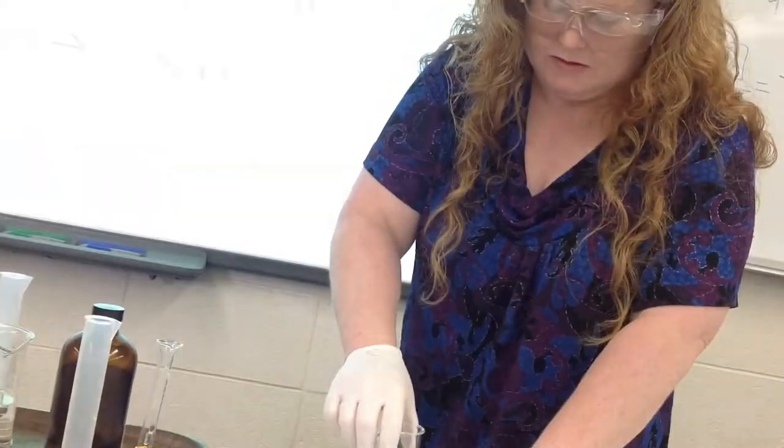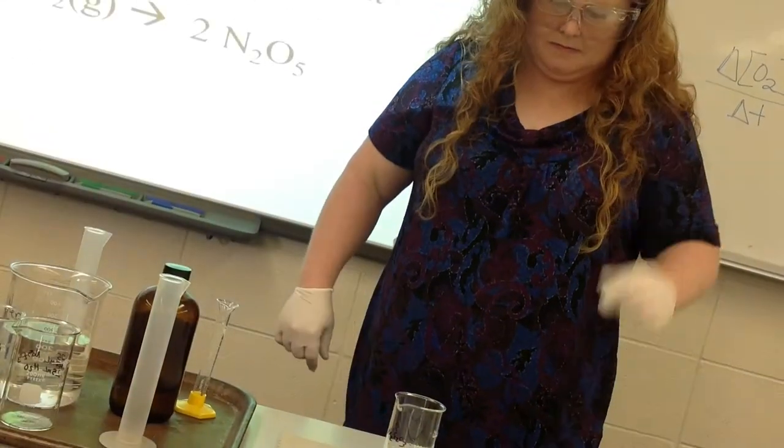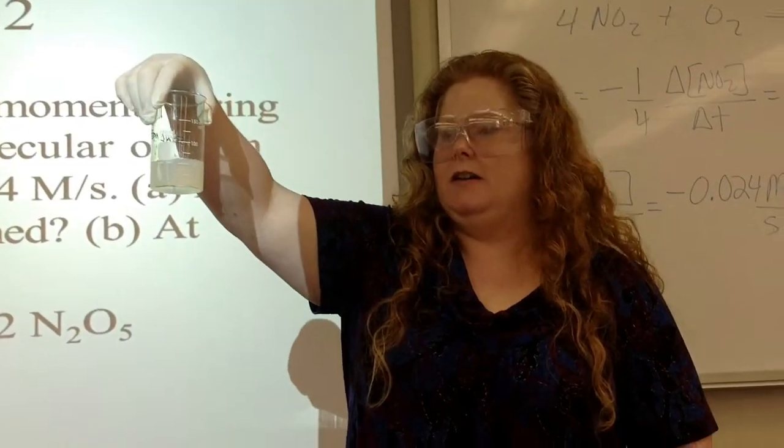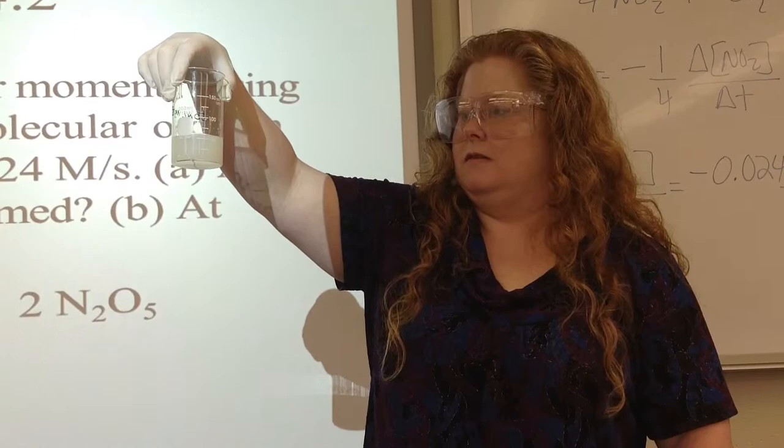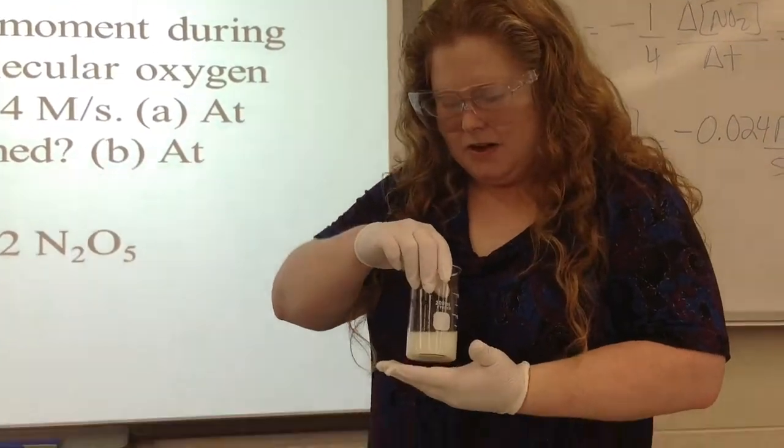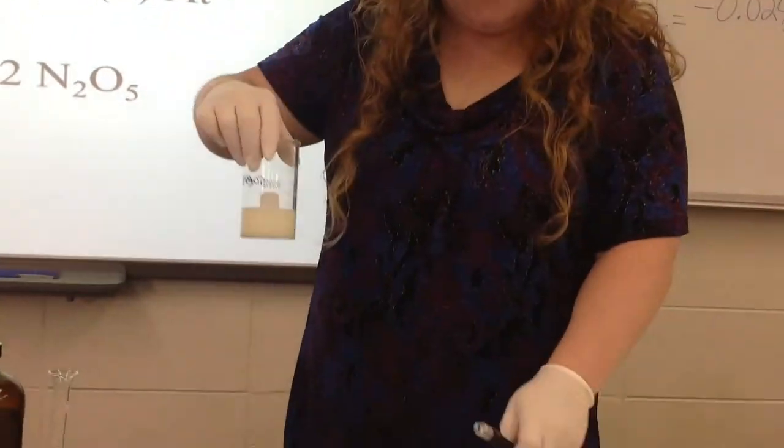So hopefully it works. Just mix a little bit. Let it stand there. And you can see it's starting to get cloudy. It's getting pretty dark. Okay, you can stop. Actually, I probably went a little too far. But it just went like that. Now, looking.